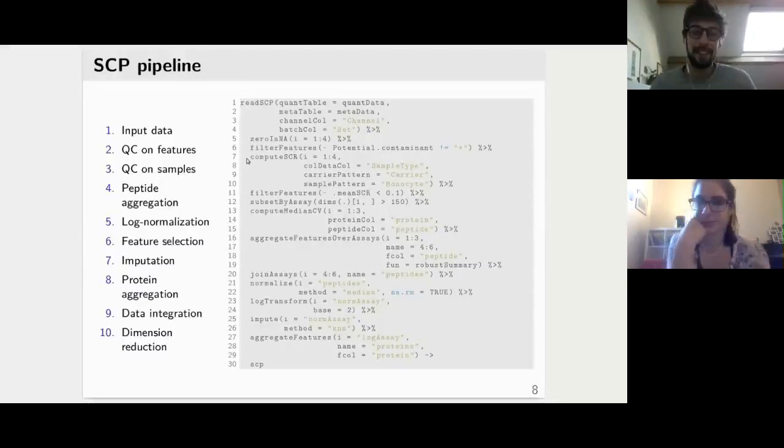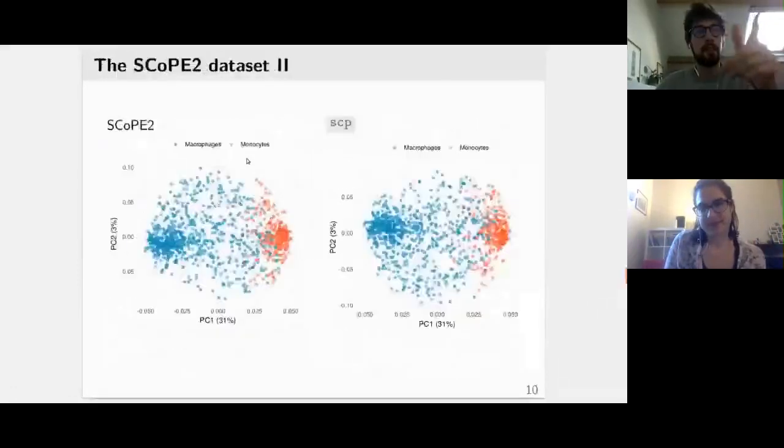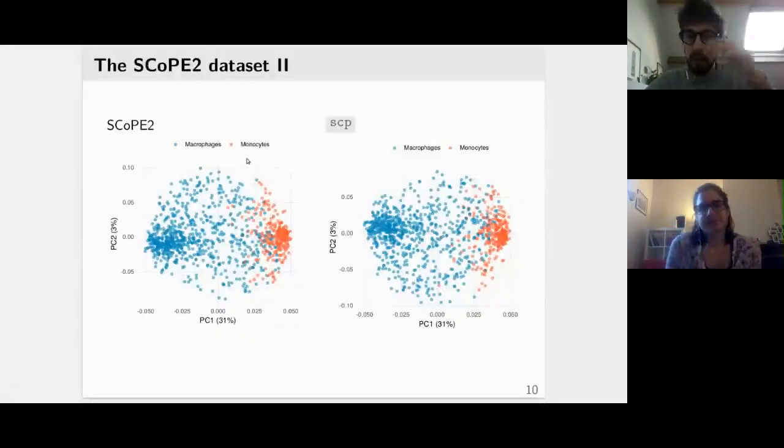Well, textbook, that's maybe still a little bit early, but I think one example I gave was with the macrophages and monocytes. This whole experiment was made to show that this could be applied to textbook questions, let's say. In this case, the question was, monocytes differentiate into macrophages, and if you know a bit about macrophages, there are two types, the M1-like and M2-like. Apparently, what was not clear yet is whether this M1, M2 is something black or white, or something that is continuous.